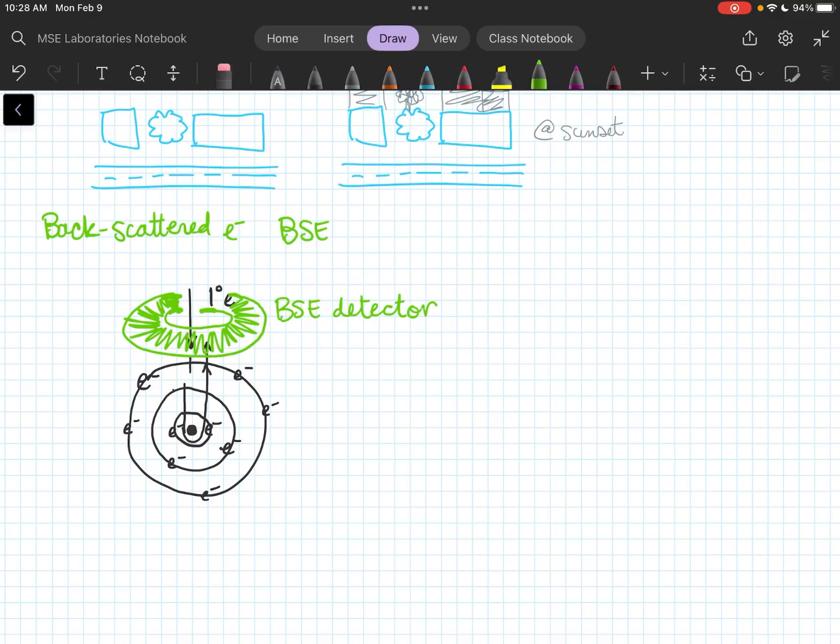That ring detector will sit really close to where those primary electrons are coming in, so that anything that is slingshotted does that full 180 around the nucleus and comes straight back up. We pick it up. Cool.